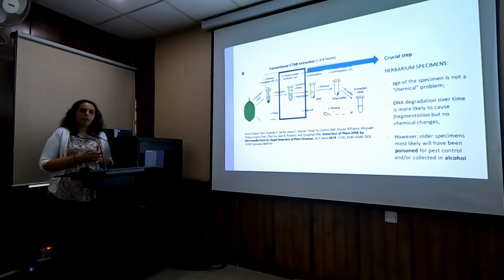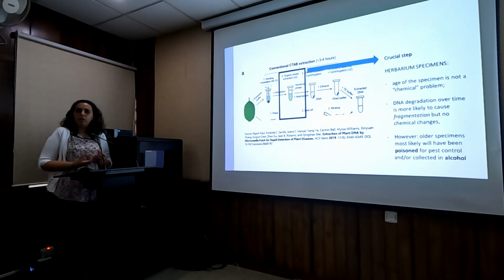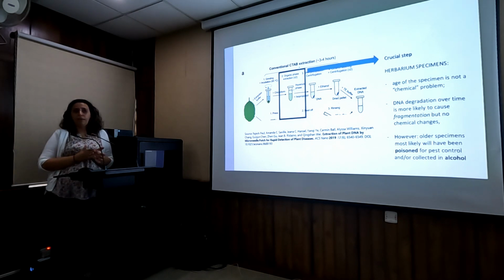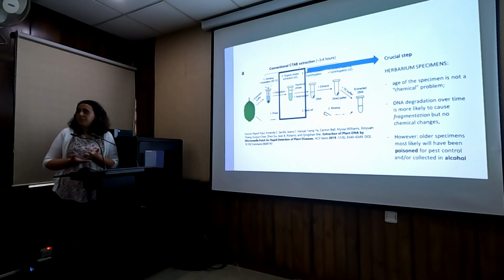It's not that these days people don't collect in alcohol, but if they want a DNA sample, they collect the whole plant in alcohol, but they keep a separate sample that has not been collected in alcohol, because the alcohol brings a lot of problems into the extraction. And there are specific CTAB modified protocols prepared to deal with alcohol-collected samples. I'm not discussing that here today, but there are protocols just for that. So this is mostly the issue with the old herbarium specimens. You have to find out whether it could have been collected in alcohol, how many chemicals it's been exposed to. Honestly, with the poisoning, I've been very frustrated most of the time, and end up giving up, because if you try many times and it doesn't work, there's really no protocol that I know of at the moment that deals specifically with this, and we just end up not using those samples.